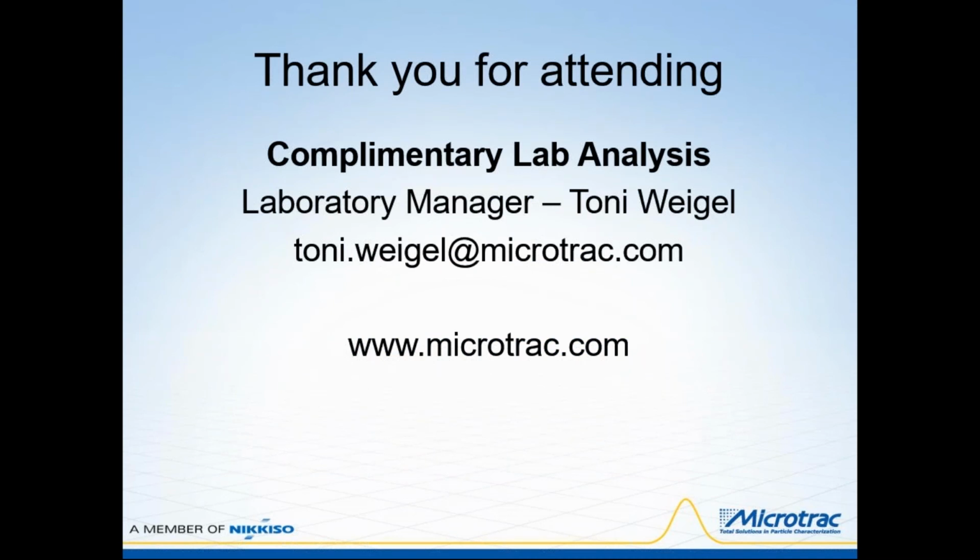So our first question comes from Mark. He asked, does the PartAn 3D correlate well with the sieve analysis? We have two different routines that can be used to develop a correlation between any of the PartAn size parameters and the actual sieve analysis data, and they can be developed to overlay each other almost precisely. And many people use these correlation routines.